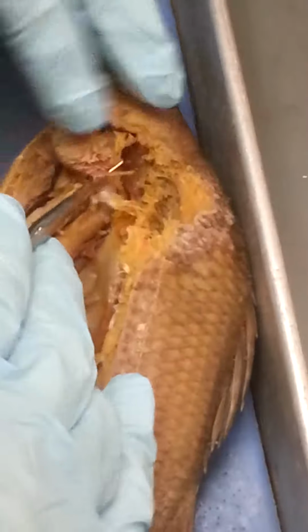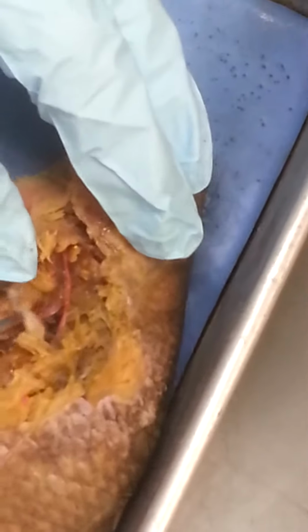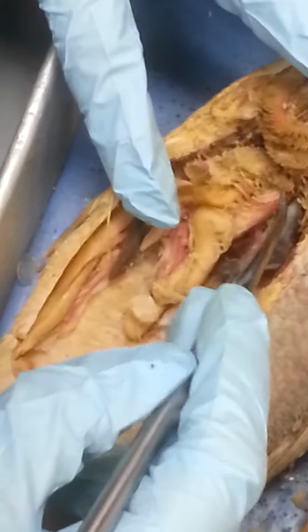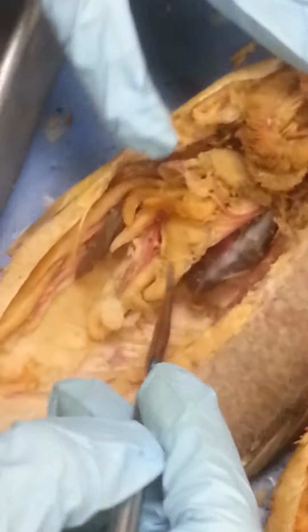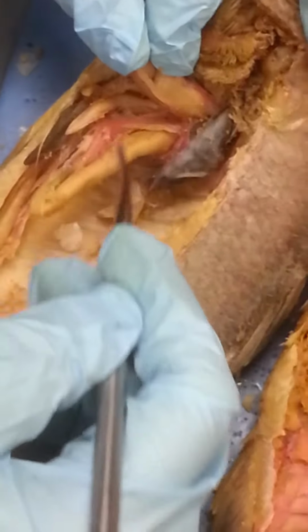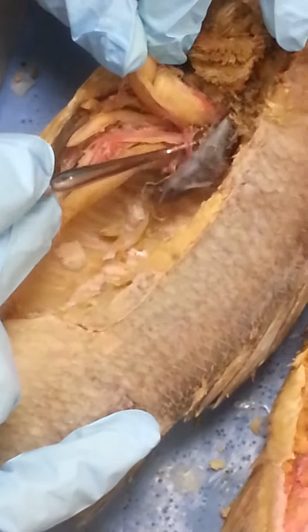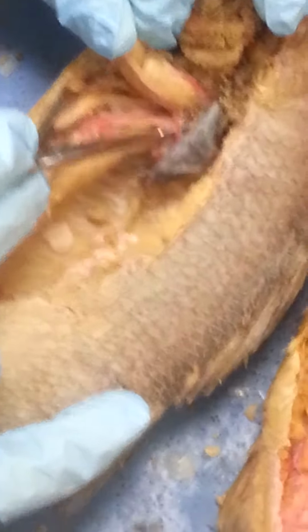Then your celiac artery, which is what I was trying to find here. It's where it's branching from all your, there it is. So see how it's coming off of that root right there, down there. Then it goes into your gastric artery from that celiac, and that's the gastric artery, and then your intestinal artery going to your intestines. Then you can see this one going right here. That's going to your gas gland, and that's your pneumatic artery.